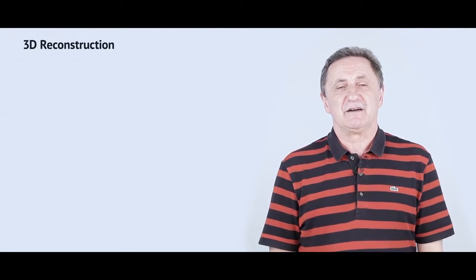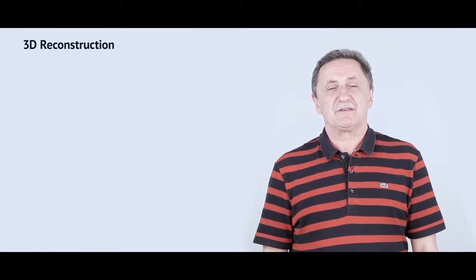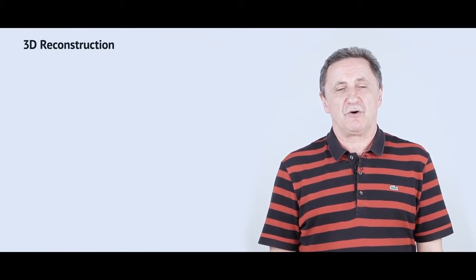On this slide, you can see a movie, which doesn't have physical sense because it's not demonstrating the changing of the phase distribution in your sample as a function of time, let's say at some temperature. This is just images obtained by slicing and viewing the surface of your sample. In some sense, it demonstrates the stack of images which you can get by using this so-called slice and view technology. And then by using 3D reconstruction software packages, you can reconstruct the 3D distribution of your elements.